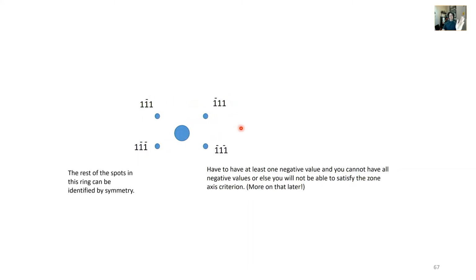If you think of a Cartesian coordinate, it's like quadrant 1, 2, 3, 4, I believe. So that's kind of how I did it, 1, 2, 3, 4. The second one's going to be opposite of 1. This last one's going to be the opposite of quadrant 2. Okay, and hopefully that is clear. Clearer than mud is my goal here.